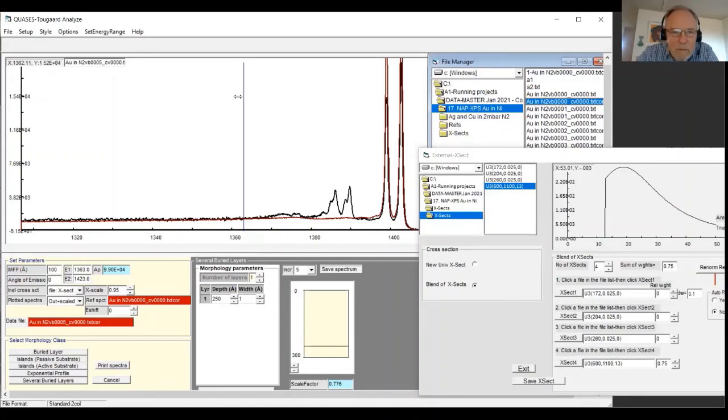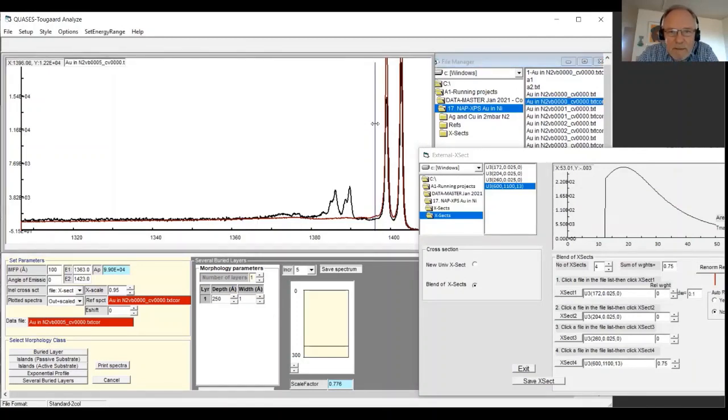So now we want to compare these. I move this out here again, so it normalizes the spectra in this region. So we have about 250. There's a little bit left here, but there will be some multiple scattering from these peaks. So let's just keep it at 0.75, and we can make fine adjustments later if needed.